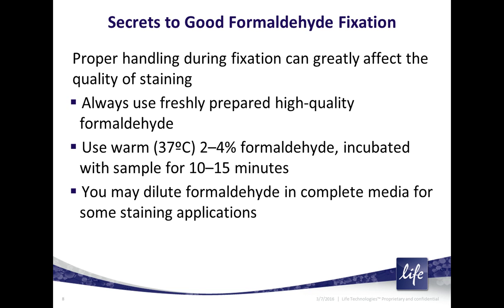And then you fix your sample by immersing them in the formaldehyde. Usually 15 minutes is very typical, sometimes longer. Tissue samples often will be kept in formaldehyde solutions at 4 degrees for several days. But for cell fixation, usually 37 degrees for 15 minutes is sufficient. You can't really prepare your formaldehyde and freeze it to use later on. That would likely lose its reactivity even despite the freezing.